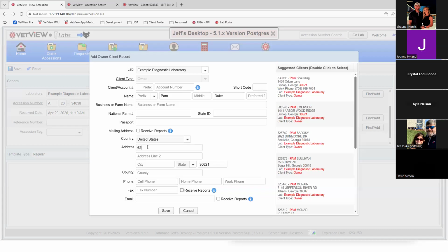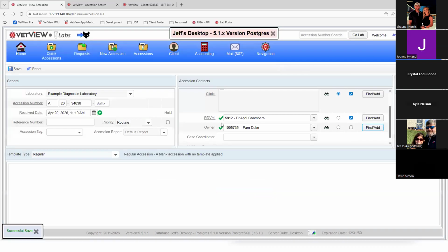You can go ahead and continue filling in the information and just hit save if it is truly a new person. So if you feel like you haven't found the person you're looking for, you can come in and just fill out the information you have, fax numbers, email addresses here, and quickly determine, no, it's not an existing person, as best I can tell. I'm going to just hit the save button, which will then add that person in, create the account and move them in right away.